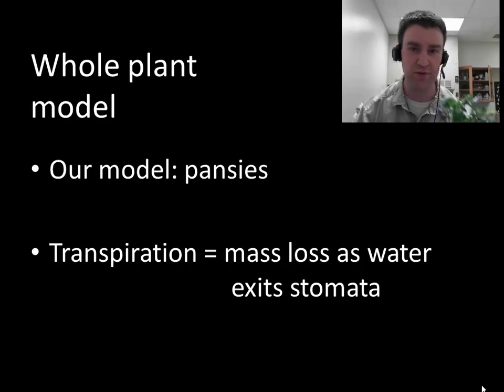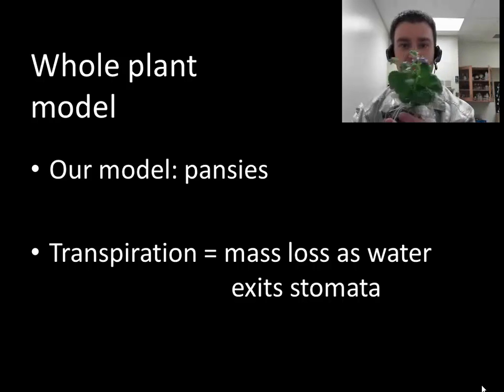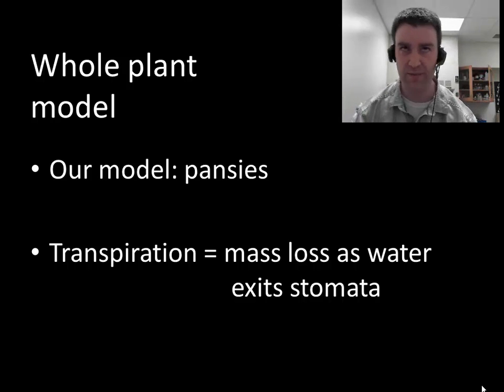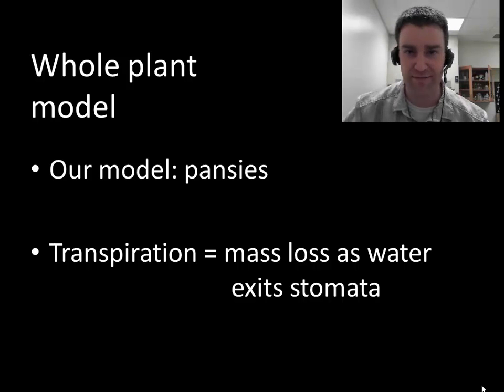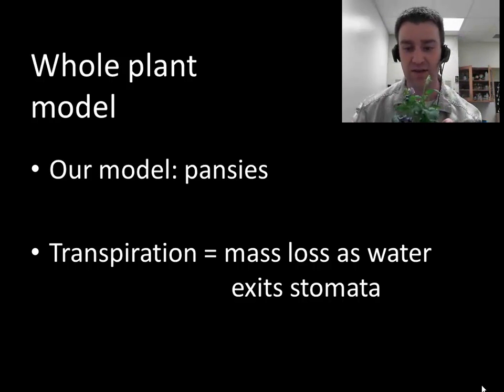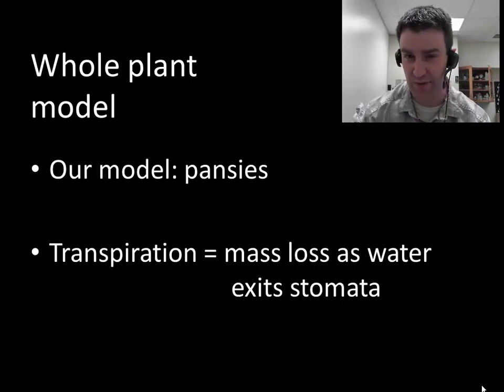We're going to use a very simple whole plant model — we're going to work with pansies, like the pansy in front of me. There's a very simple way we can measure how much these pansies transpire over the course of a week: we're simply going to measure how much mass they lose. The transpiration rate will be the mass of water they lose as water exits the pores called stomata of their leaves.